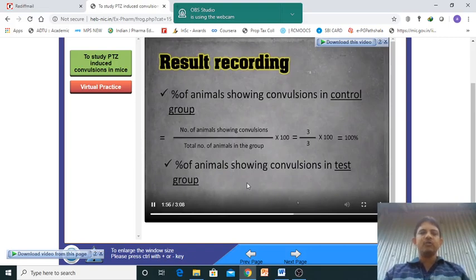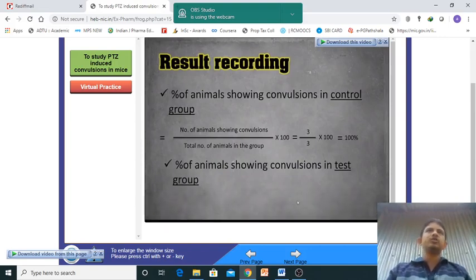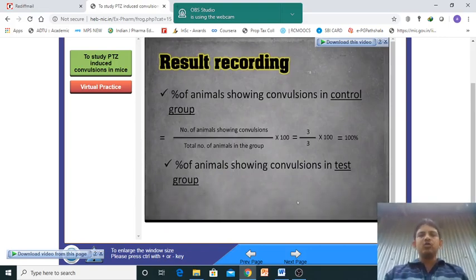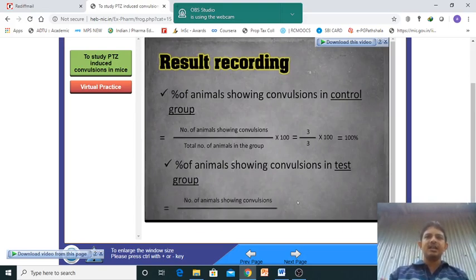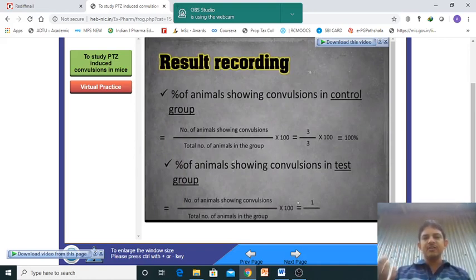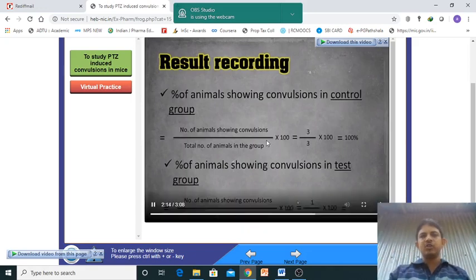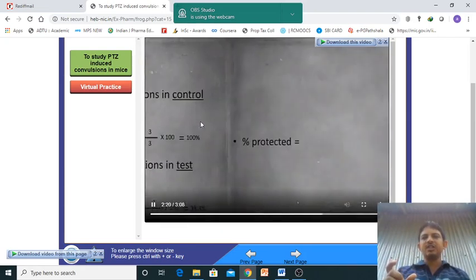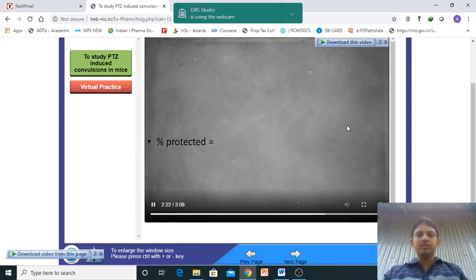We check how many animals in the saline group show convulsion. You need to understand how we are evaluating the PTZ-induced convulsion. In experimental work, we also check the time spent by the animal in convulsion mode — that time span is an important parameter.